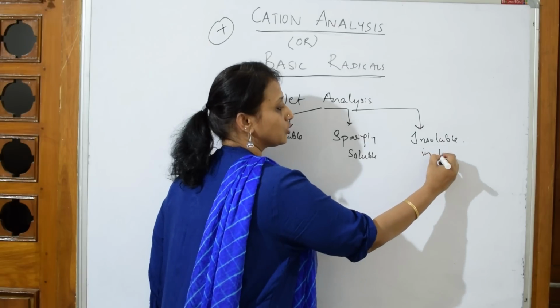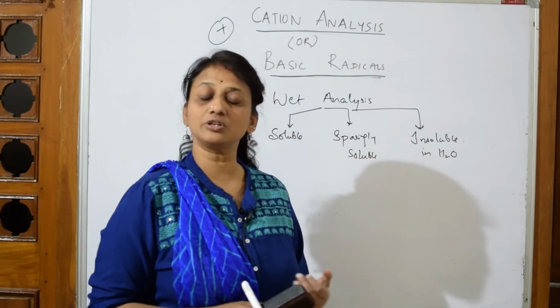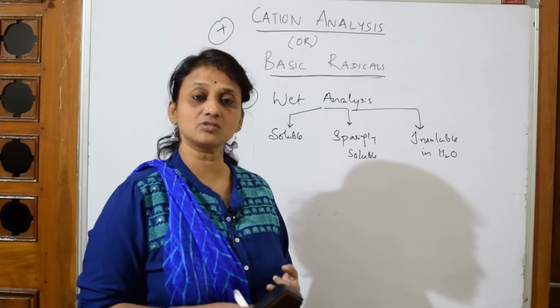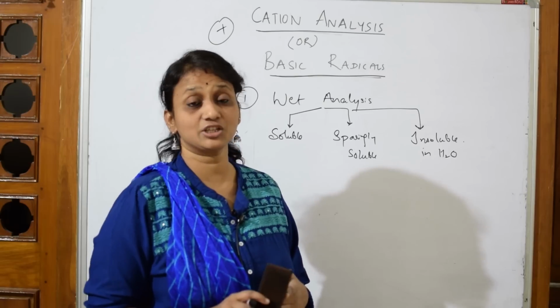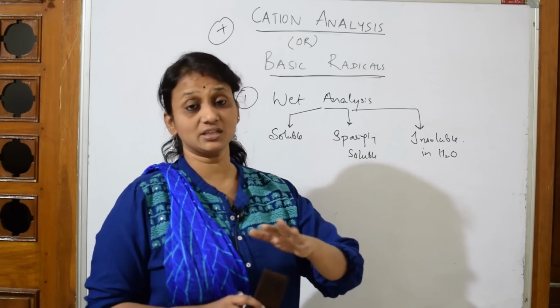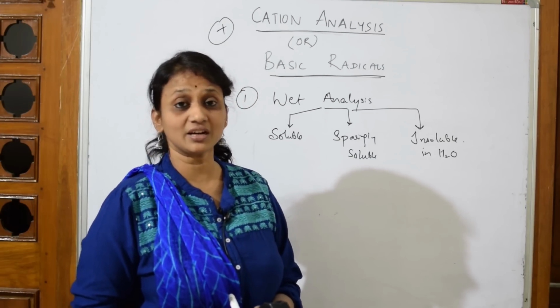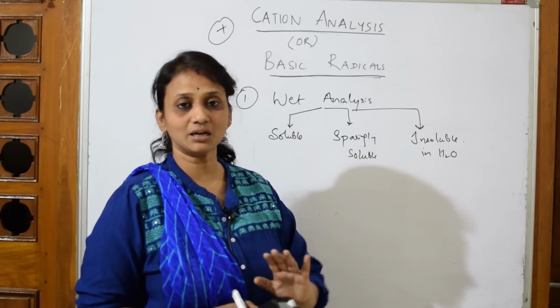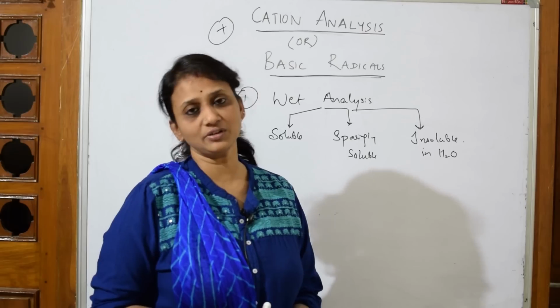Insoluble in water. So whenever we are doing this wet analysis, we see the solubility with cold water, with hot water, with dilute HCl, and with HNO3 also. Very rarely they will give you solubility testing with aqua regia also. These are the different acids you will be testing, but the common salts given to you are water soluble salts only.